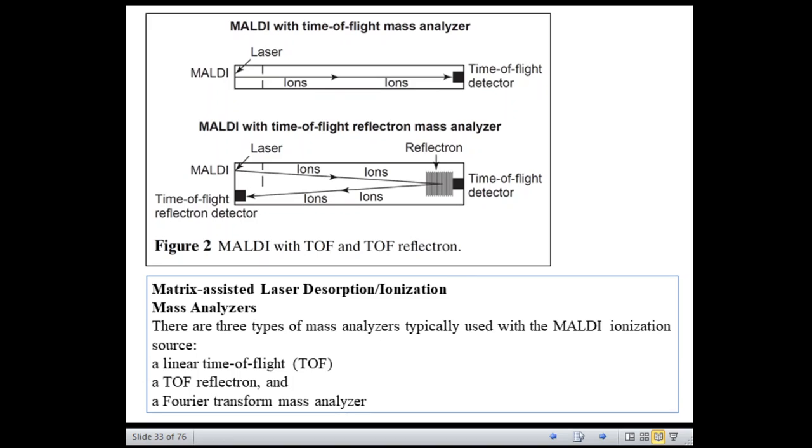So in that case we are trying to understand the working principle of MALDI-MS. So we saw how the desorption occurs and what is most critical with relevance to the process of ionization in MALDI-MS. Now we will try to understand the mass analyzers.